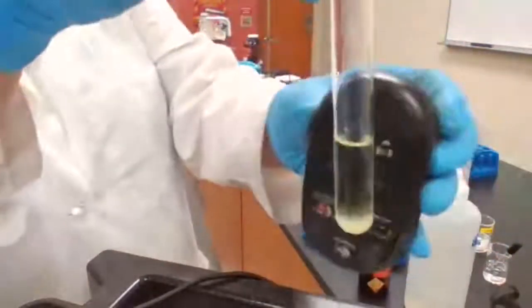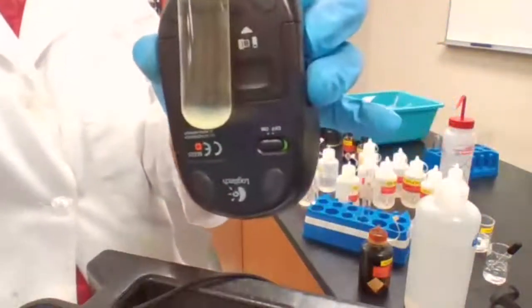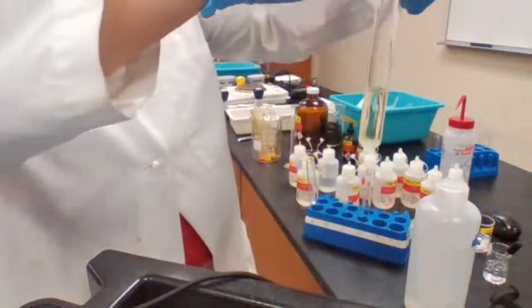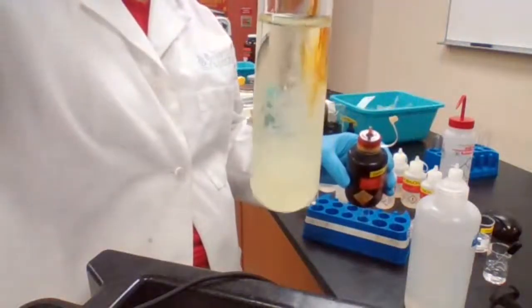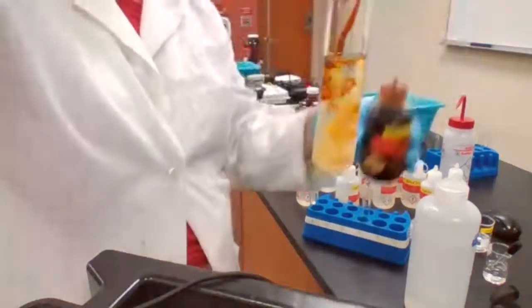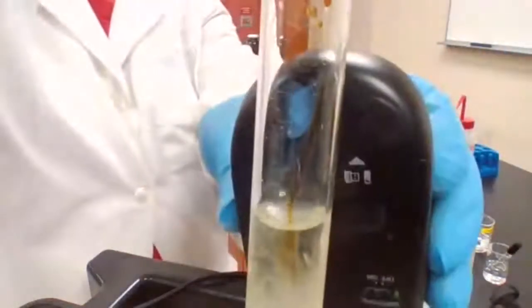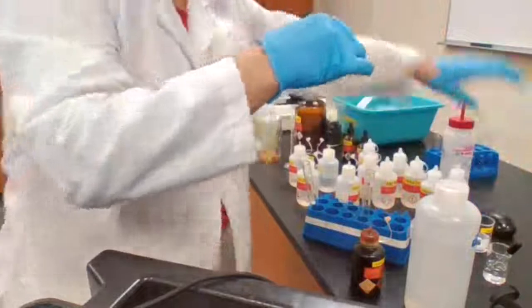Maybe you could see better with the black background. It's yellow color. Okay, with the black background, or when I add the drops, you see that it's turning more cloudy. See, the precipitate is forming when I'm adding this. So that was the C. Okay, good. Did you see it? Okay, perfect.